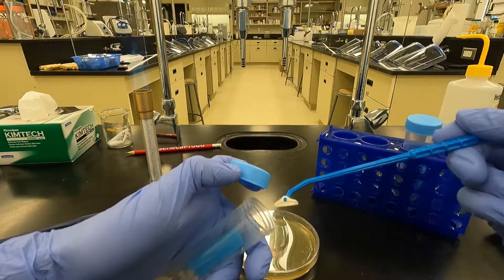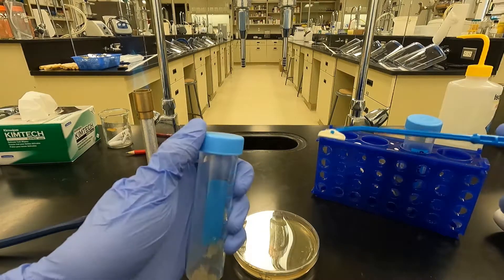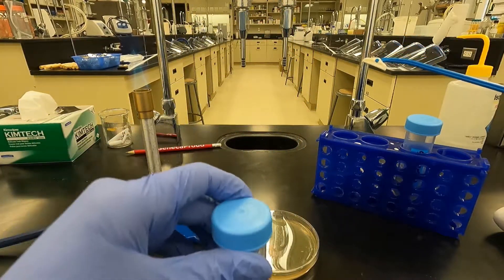Sometimes the agar can stick to the end of the scraper, so I like to just rub it off on the side of the tube and tap it down a little bit.